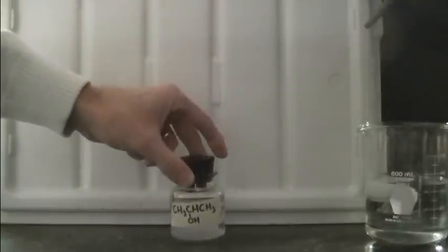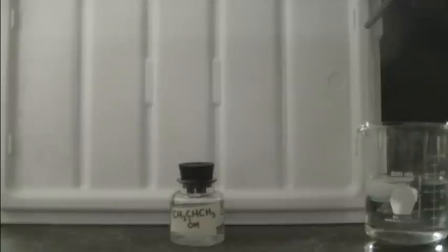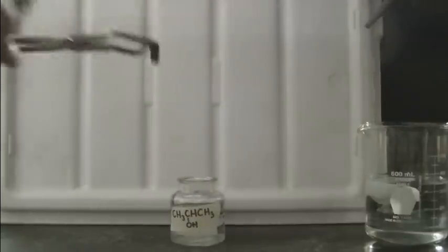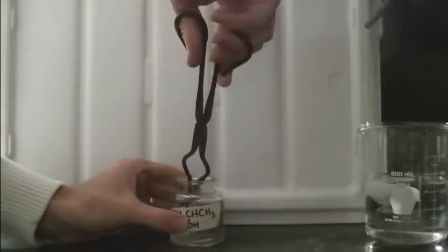Now we're going to test the third alcohol isopropanol. And one might hypothesize that because the methanol one carbon alcohol completely combusted, the two carbon alcohol ethanol showed some signs of both complete combustion and incomplete combustion, one might surmise that the isopropanol which is three carbons long will follow this trend. And we should see a lot more incomplete combustion rather than complete combustion with the isopropanol. Let's run the combustion reaction and find out.